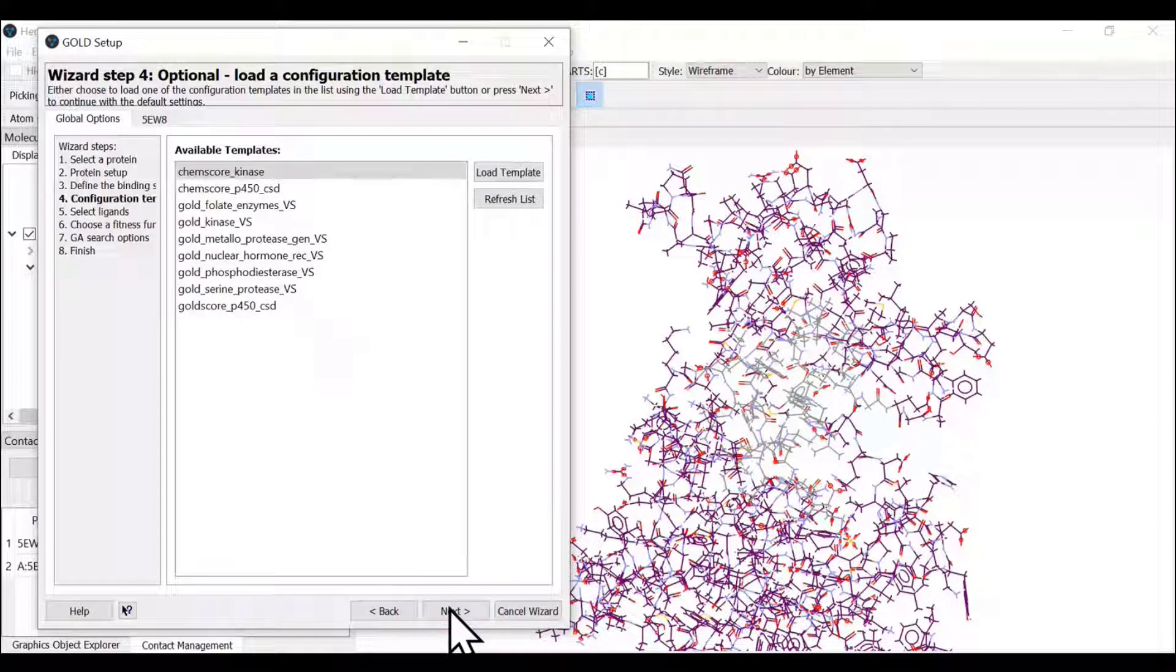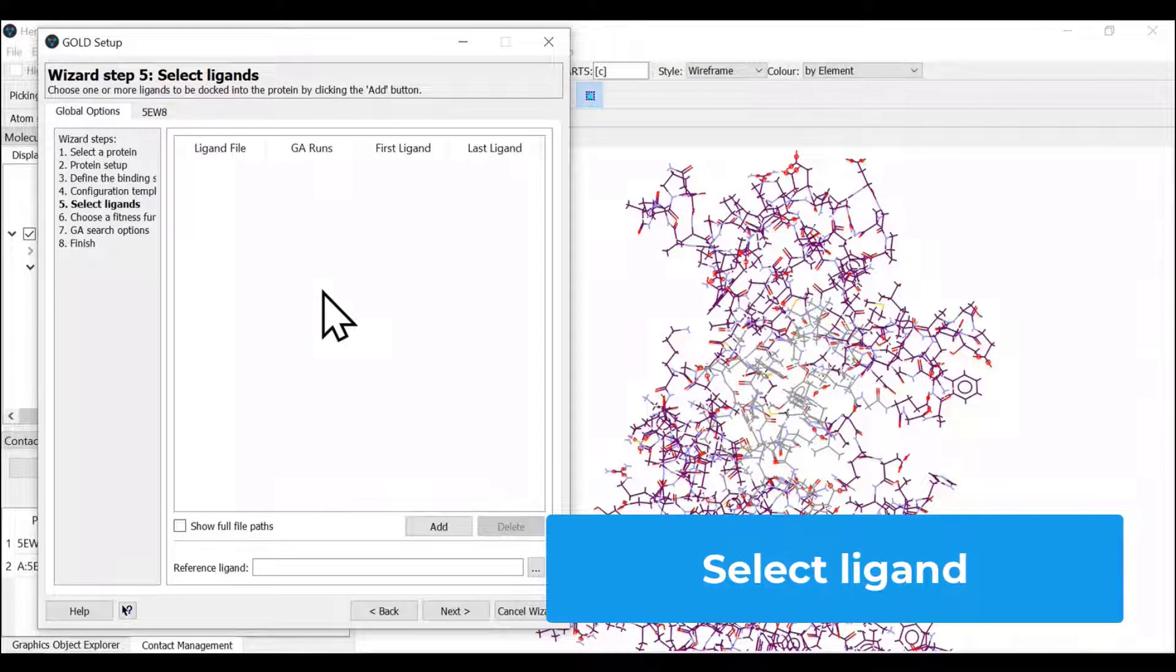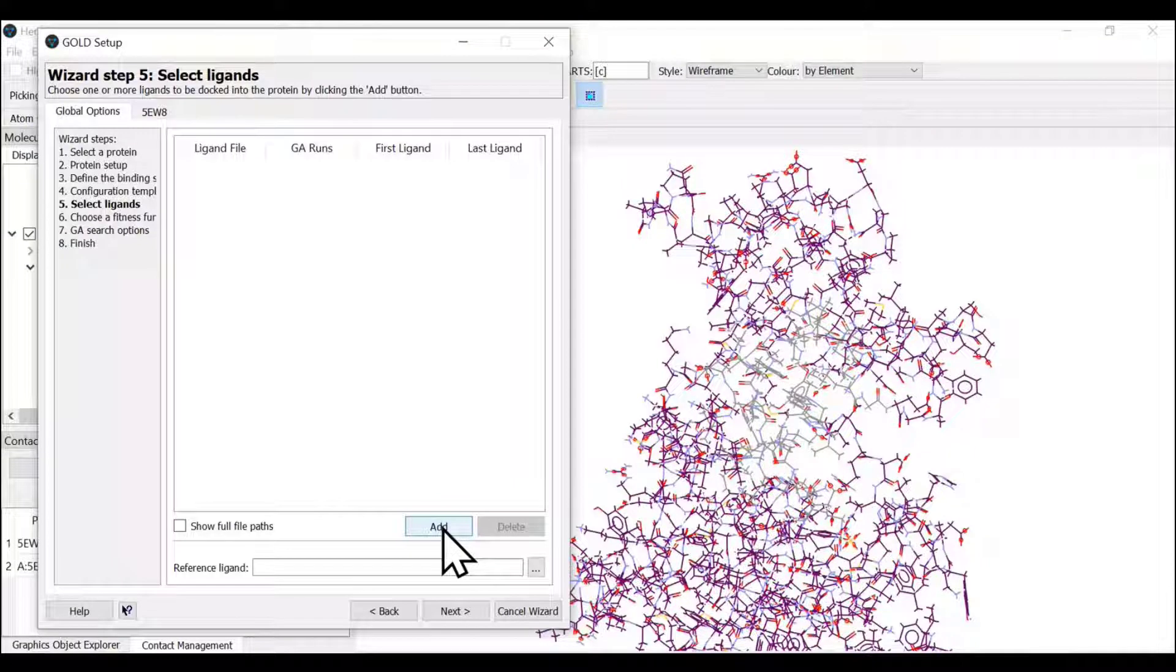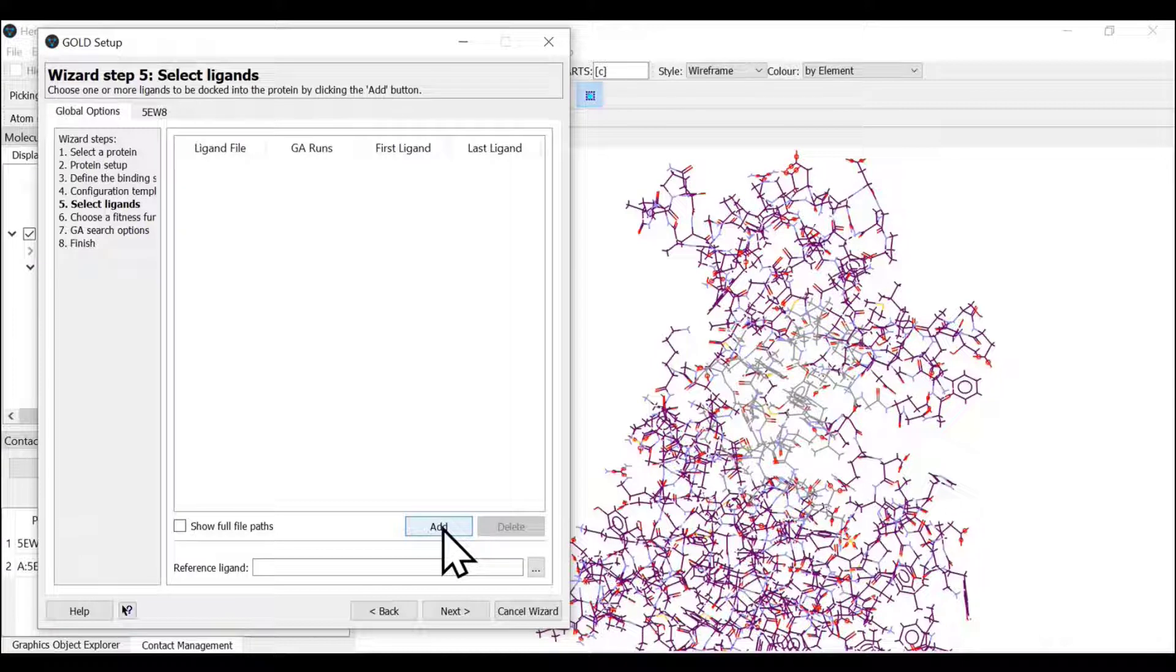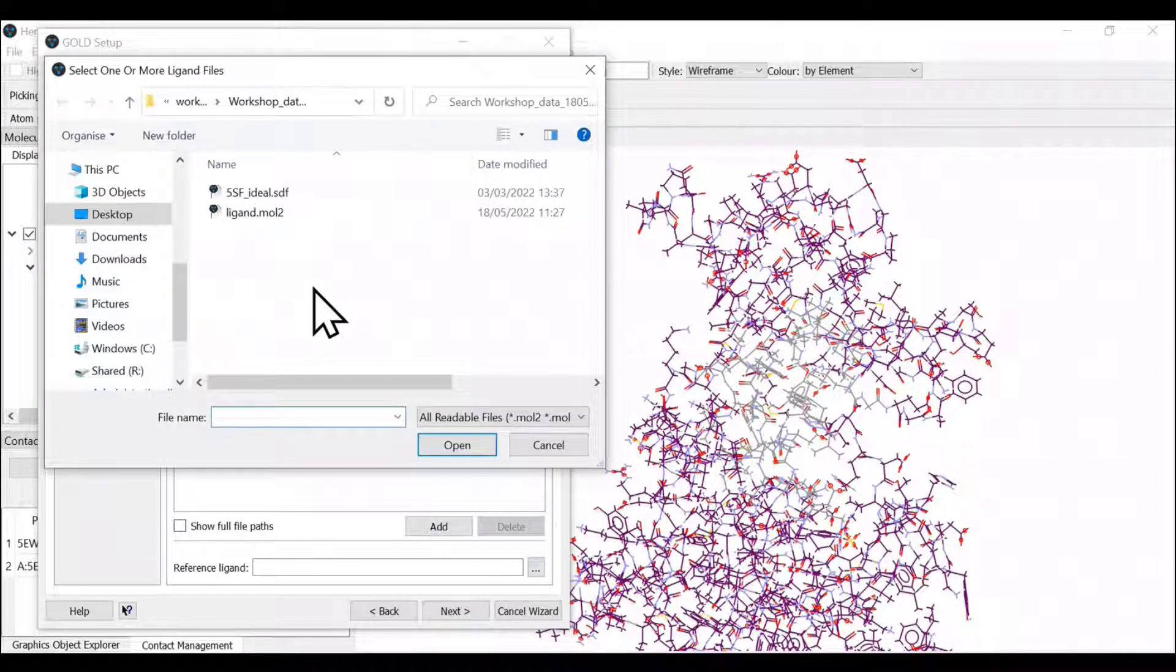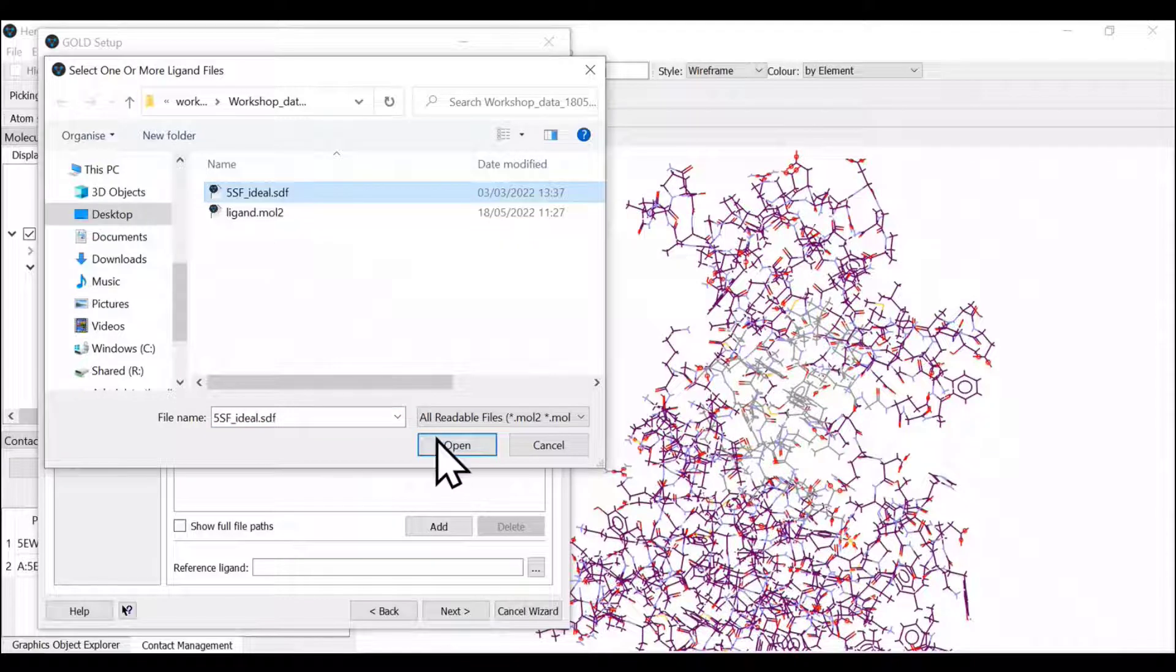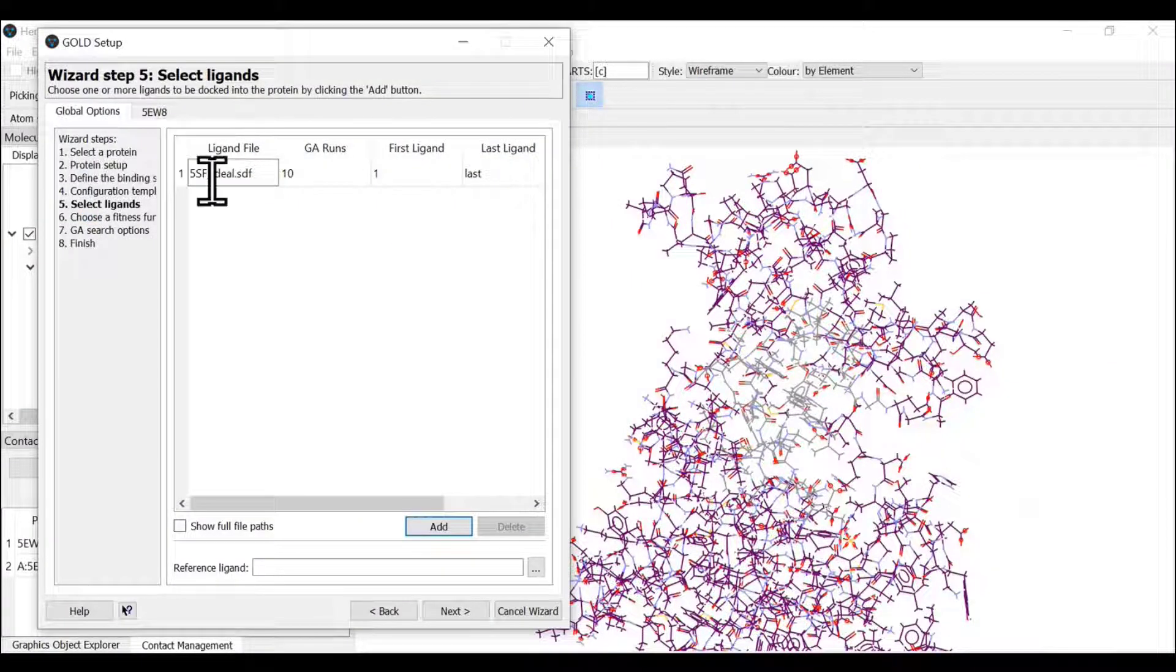Wizard step five is to select the ligand. This is a crucial step where you add a ligand molecule for docking. This ligand can be in SDF format, mol, or multi-format. Single or multiple ligands can be added. We're going to add 5SF idealized ligand. The ligand file is uploaded.